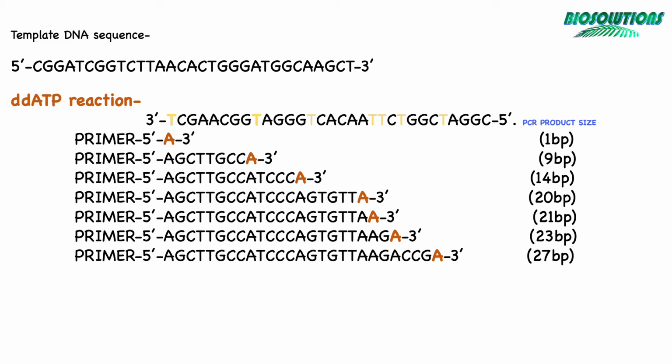In the first tube, for all the thymines or T bases present in the template sequence, we need A base. This tube has 2 types of A nucleotides, normal dATP and ddATP. Based on probability, the new sequence can incorporate a ddATP or dATP against any of the T base in template, as DNA polymerase cannot make out the difference while picking up the nucleotide. However, it can't extend the polynucleotide chain further.